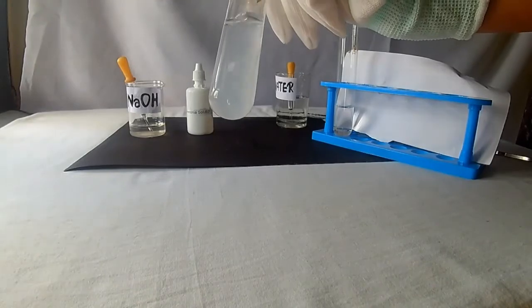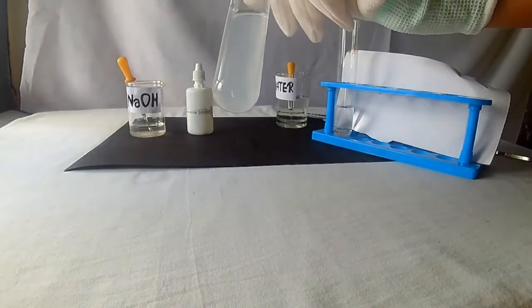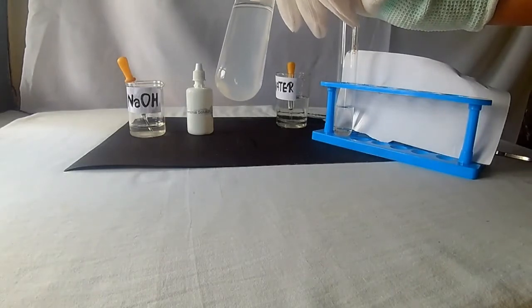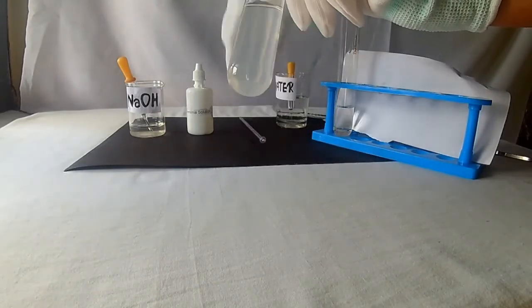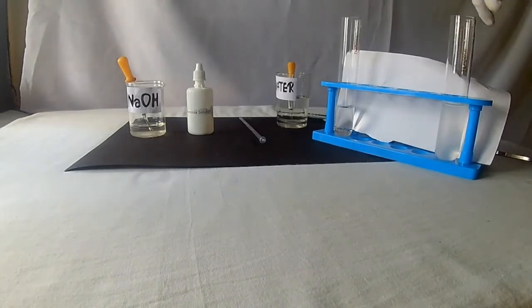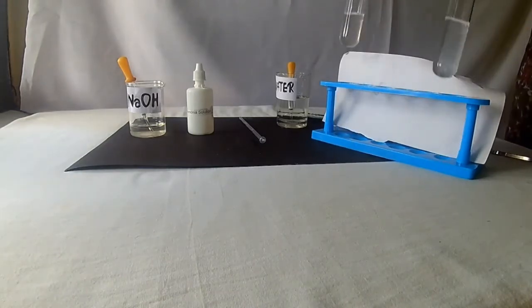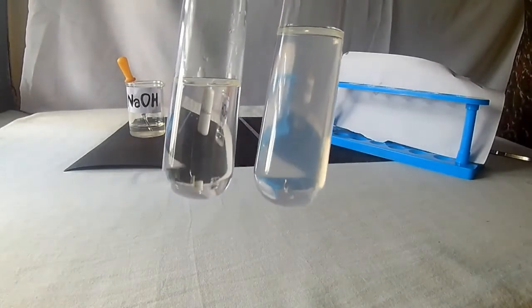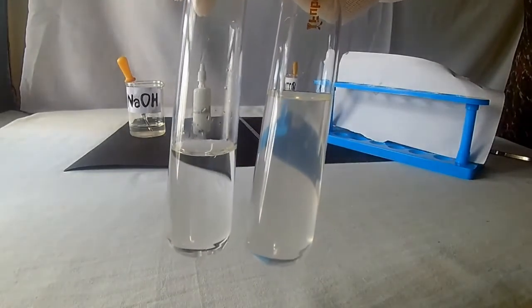Yes, it is dissolving. A clear solution is being formed. The inference is with excess sodium hydroxide and ammonium hydroxide solution, zinc salt forms a colorless solution.